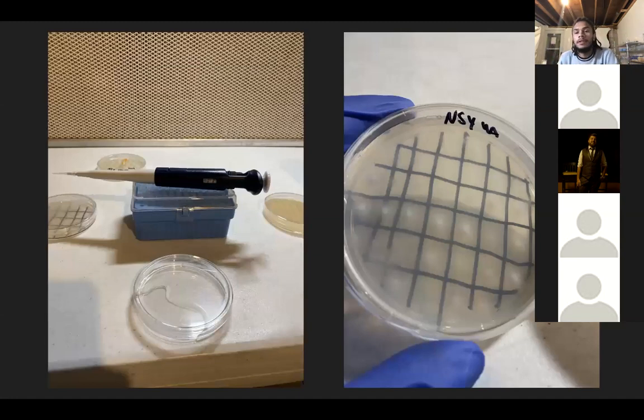Once you have spores on your agar, you can do one of two things. You can either look under the microscope, find a single spore and pull it out with a scalpel, which is kind of hard, but that's what I do. Or you can do serial dilutions.